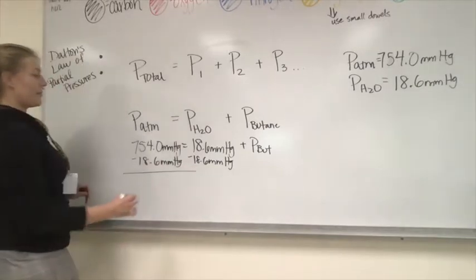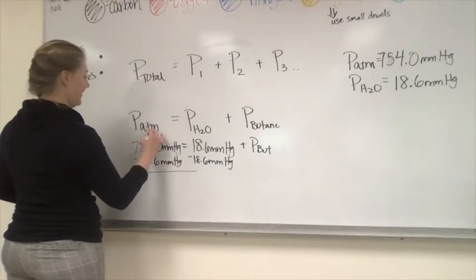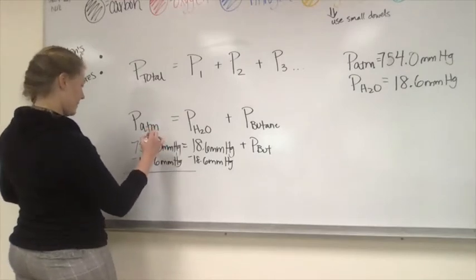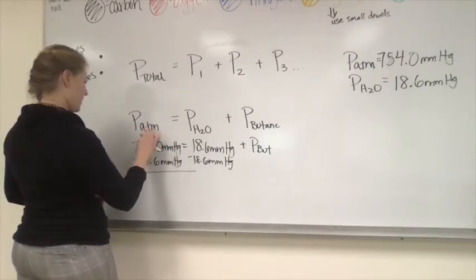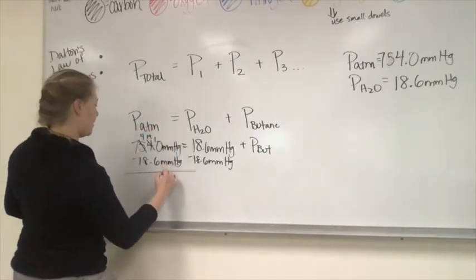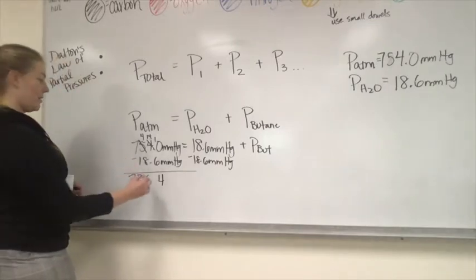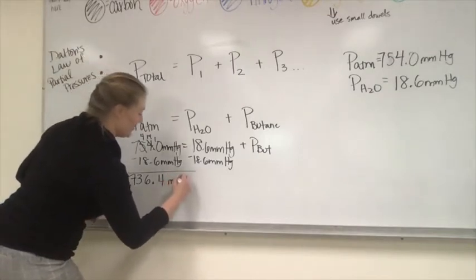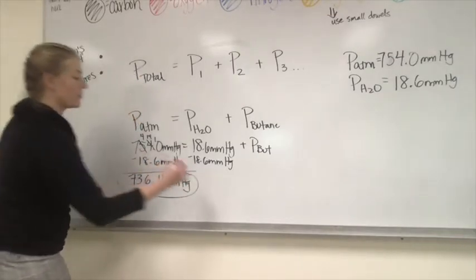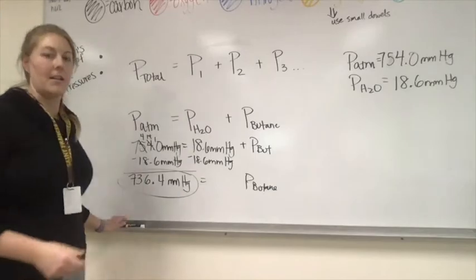All right, now I'll check my math that I did earlier. I don't think I did my math right. No, wait. Okay. You have 746.4. It should be 736.4. Okay. All right. So that would be our partial pressure of the butane gas. We'll change that in our data table. We only do one shot here, so we're not refilming.